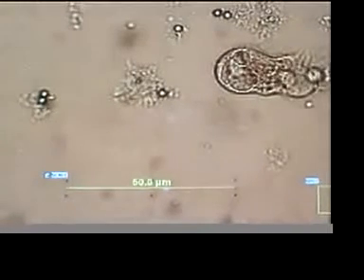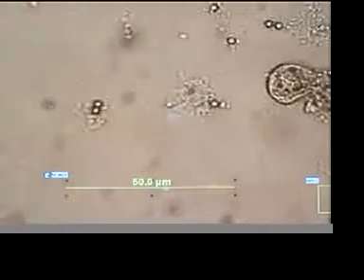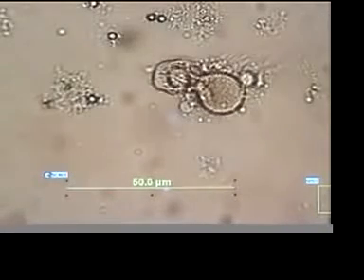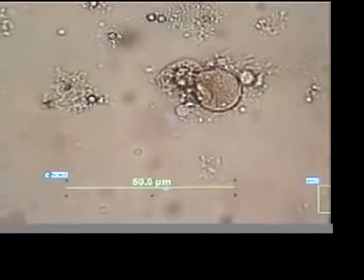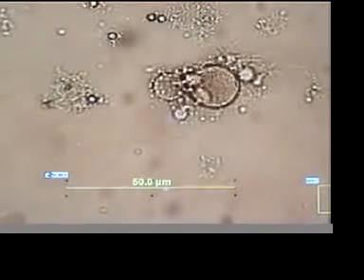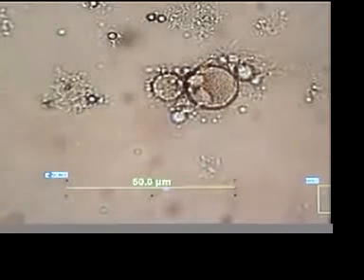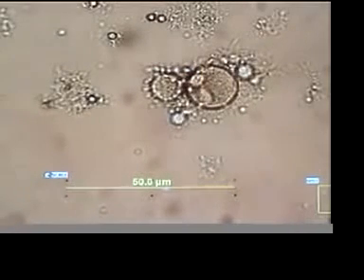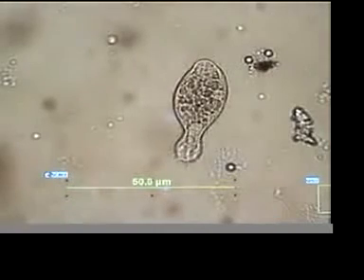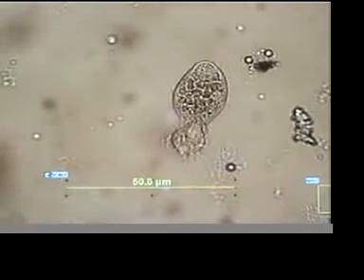We have a hit. We'll try to center him. Sorry, I went the wrong way. Here we go. There's a live hit. The scale is correct. This is in the upper right center of the slide. This took 2 passes. Here we go. We caught it live.